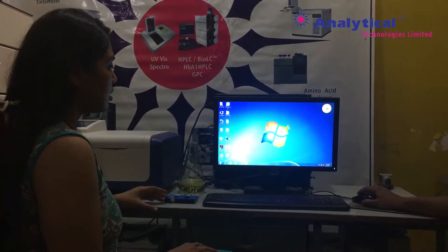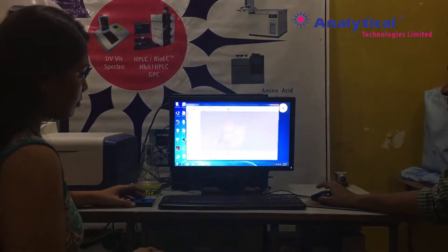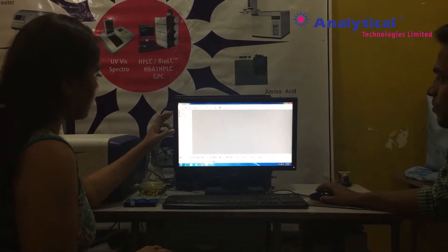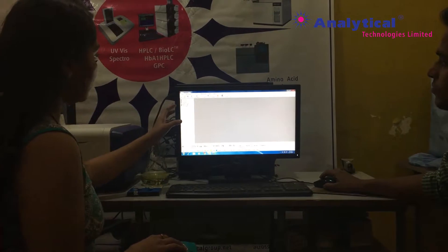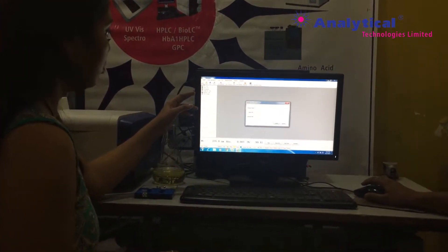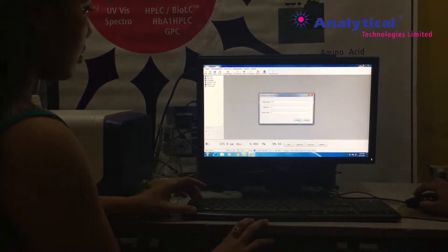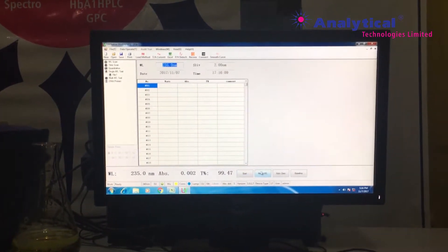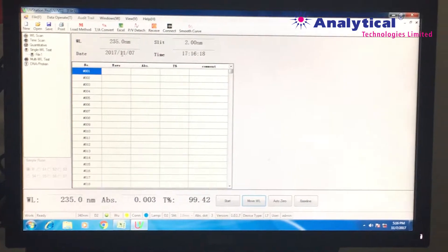For this software-based system, you need to go through UV Station, the particular software. A screen is displayed in which you can find options: wavelength scan, time scan, quantity, single wavelength, multi-wavelength, and DNA/protein analysis. For the single wavelength test, go to the single wavelength option. On the next screen, you need to set a particular wavelength — here you can set it, for example, to 235nm.